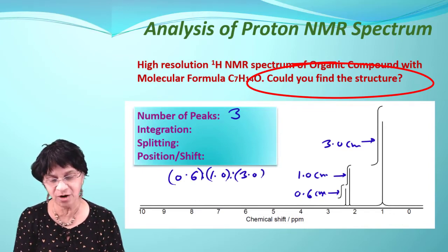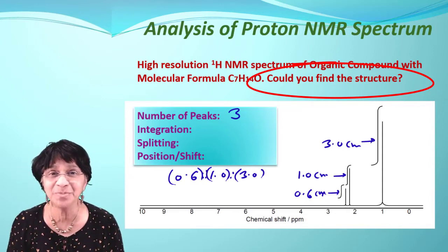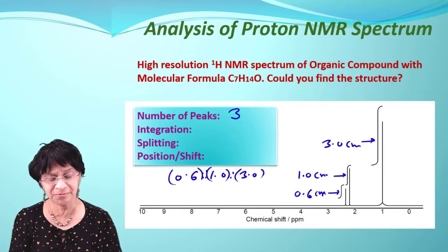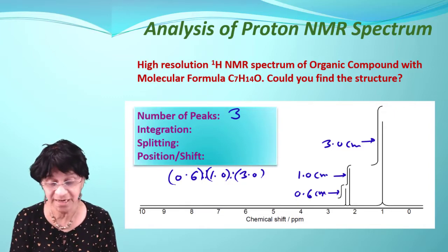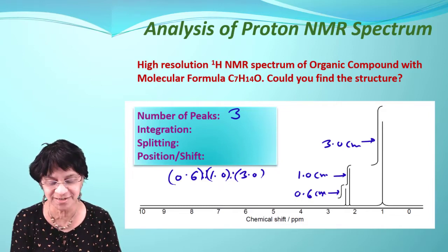And we need to find out these as a ratio of integers, because protons cannot be fractions. So if you look carefully, 1 is 1/3 of 3 and 0.6 is 2/3 of 1. I'm just saying sometimes mental math helps quickly to decide the ratio in the form of integers.